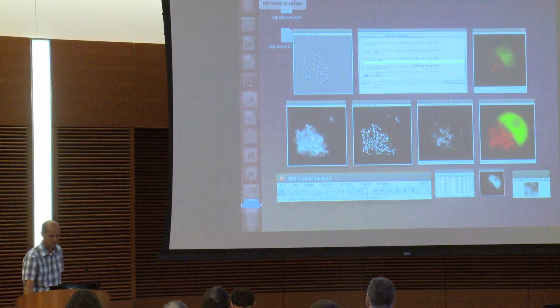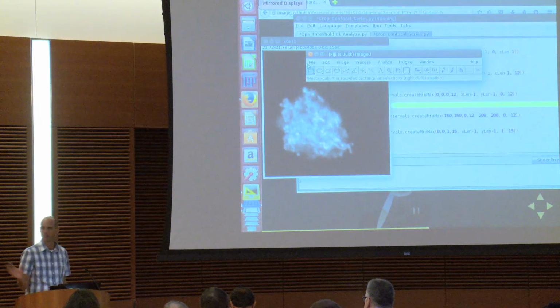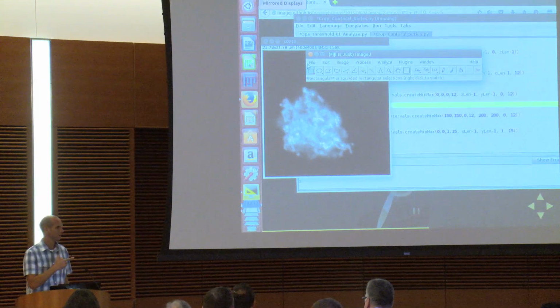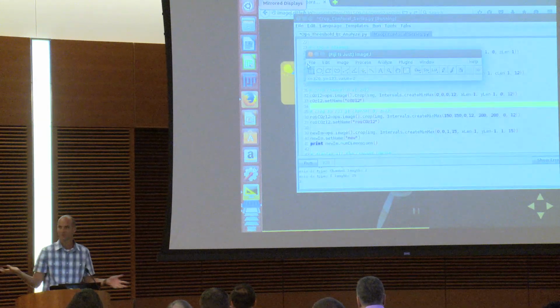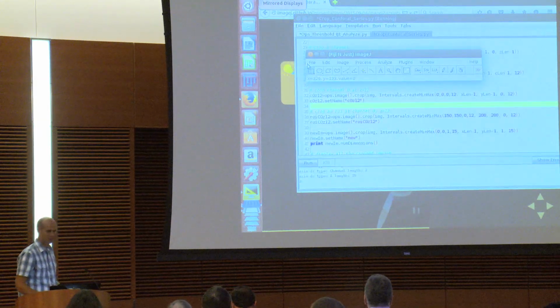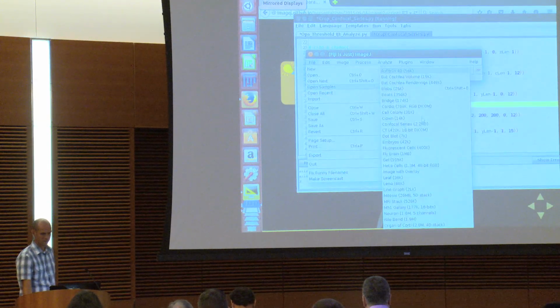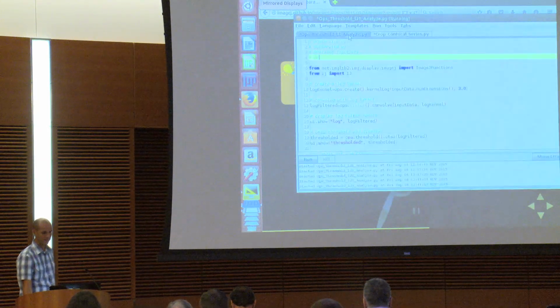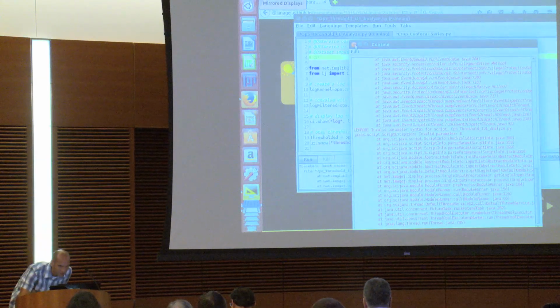I think Wayne mentioned yesterday there's a new shortcut to close all images. Is there? Yes, Shift W. That's awesome. So Shift W, then go to File, Open Samples, and go to Confocal Series. We got our confocal series back. Go to our first script, run it. Oh, no. Huh.